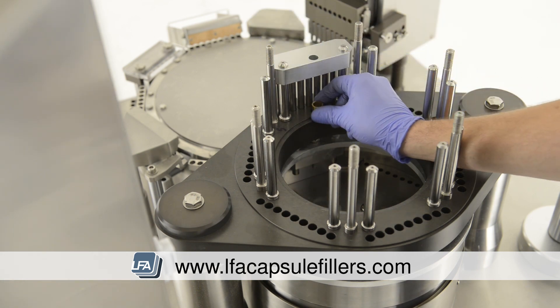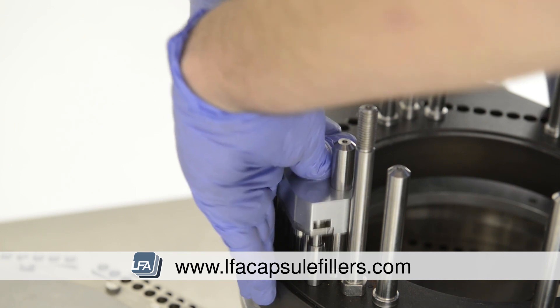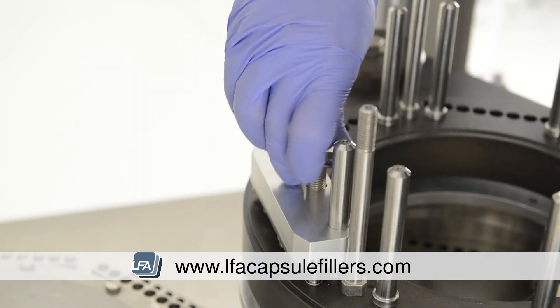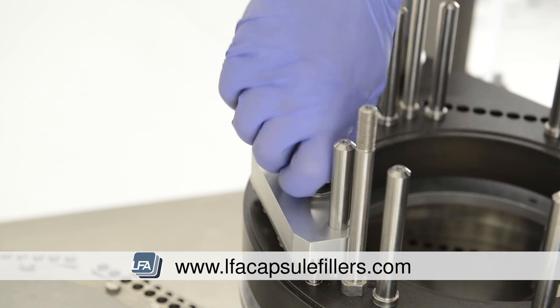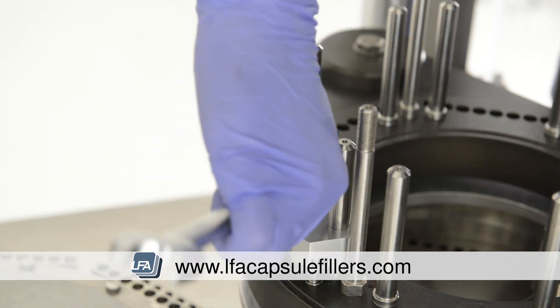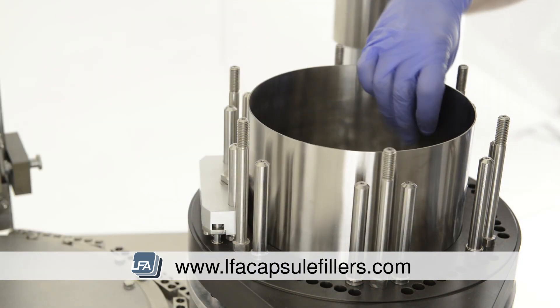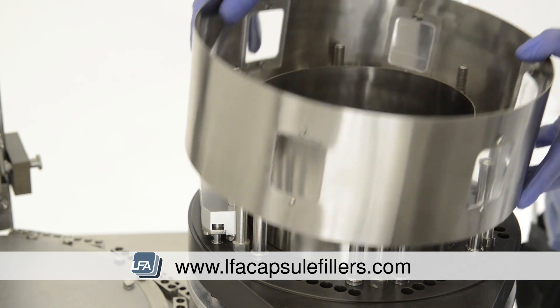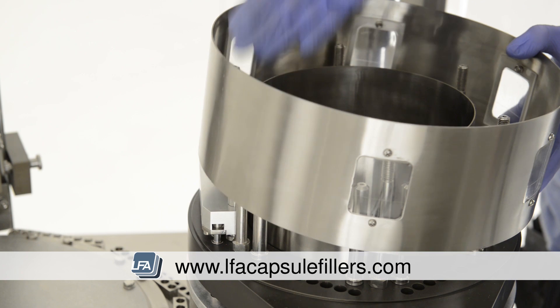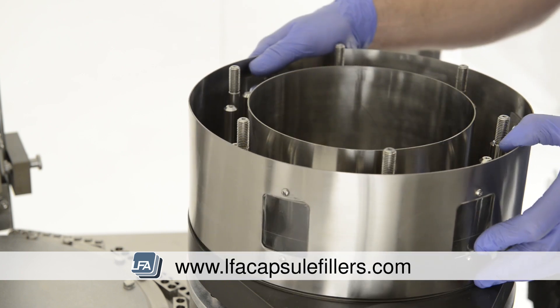Now we're replacing the block with our first tamping tool. Whilst doing this, place the brass ring into position. Replace the 19mm bolt into the block through the brass ring and tighten fully. Now replace the middle casing, which will sit in the groove in the middle of the machine. You're then able to replace the outer casing — the section without windows needs to be in station six, facing the middle of the main turret. The other windows need to be facing stations one to five.